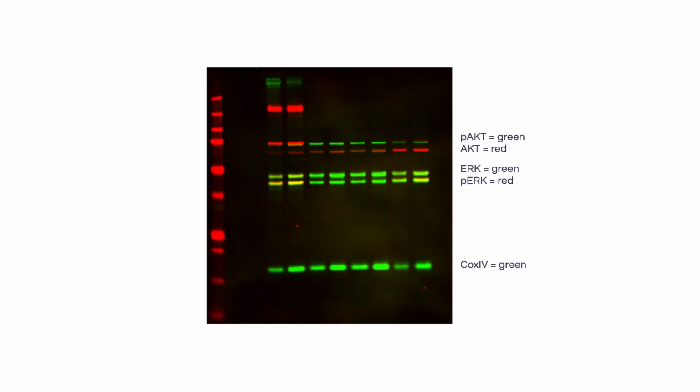Besides, if you do need to detect more targets, it's still possible to multiplex further without adding more channels, provided that each of the targets is uniquely identifiable by its molecular weight. For example, in this blot, 3 targets, phospho-AKT, total ERK, and COX-4, have been detected in one channel, which is shown in green, and 2 further targets, total AKT and phospho-ERK, are detected in the other channel, shown in red, for a total of 5 targets detected at once.